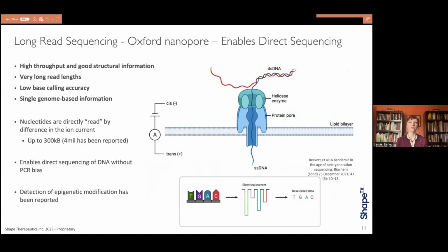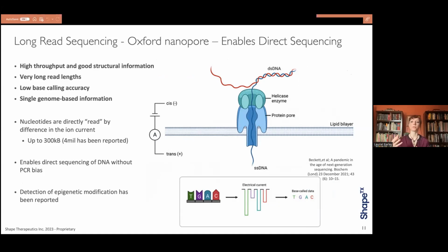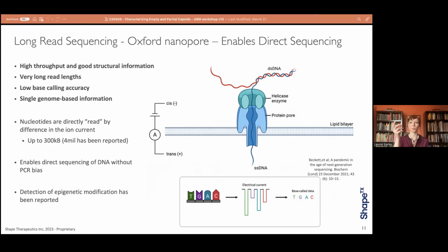So a long read sequencing technique, for example, is Oxford Nanopore, and this is a very different style of sequencing than what you would get from the Illumina because you're not using sequencing by synthesis. In this case, you're taking double-stranded DNA molecules, and they have to be double-stranded to be adapted. That adapting process will put a motor protein onto them, and then that will be attached to a protein pore. And using the motor protein ability, it'll be pushed through the pore, which is embedded in a lipid bilayer. And this actually is an ion channel.